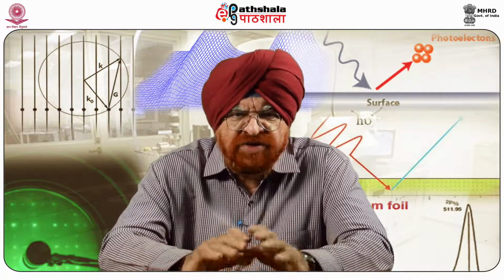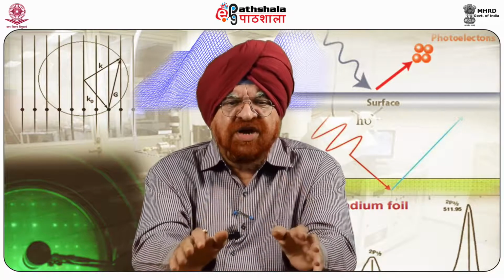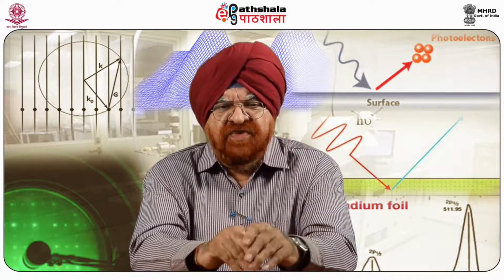Since the samples showed a flat surface, the magnetic activity of these three films was evaluated by scanning the MFM tips along a 20 micrometer line across the crystalline quartz substrate, partially covered by the desired germanium film.